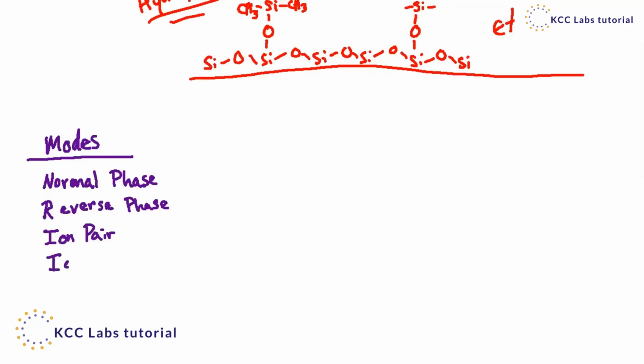Okay, so each of these has their own unique way of dealing with stuff. So sometimes when you're dealing with the ion exchange columns, you might be using some sort of a buffer, like a sodium buffer at different concentrations. Whereas when you're doing just the regular phase or the reverse phase, you're using water and organic solvents instead of a salt or a buffer system.